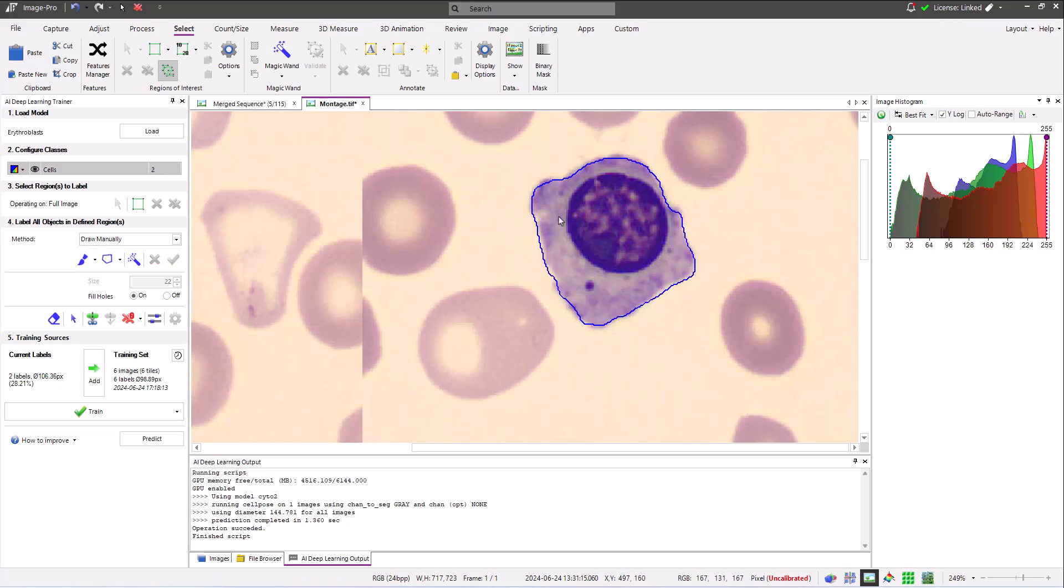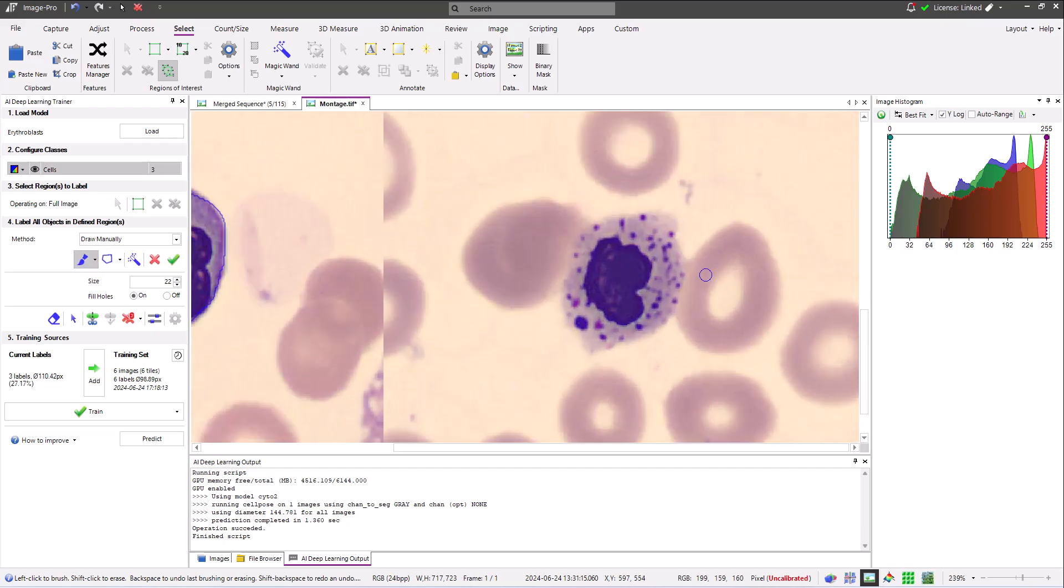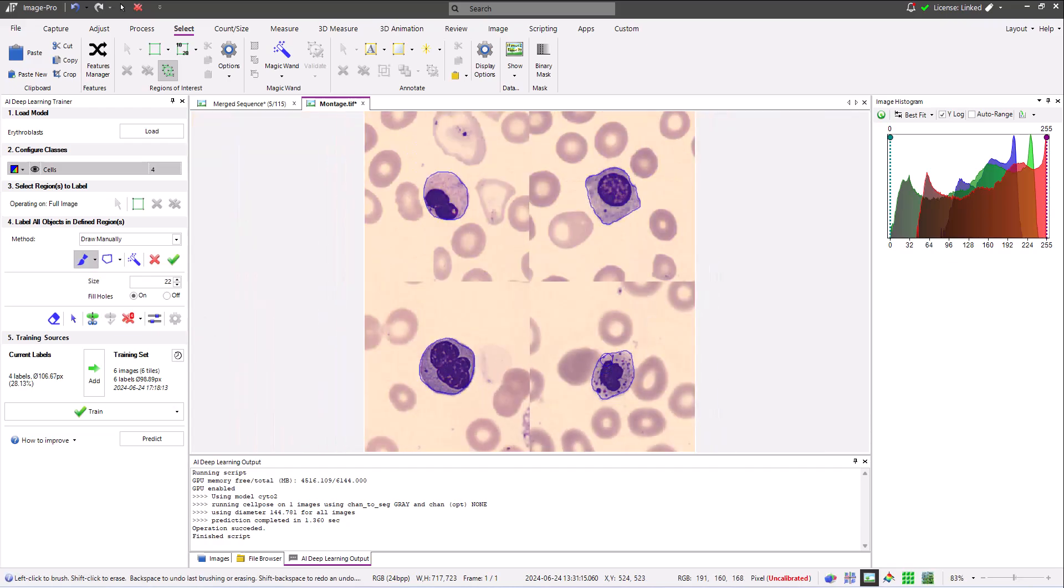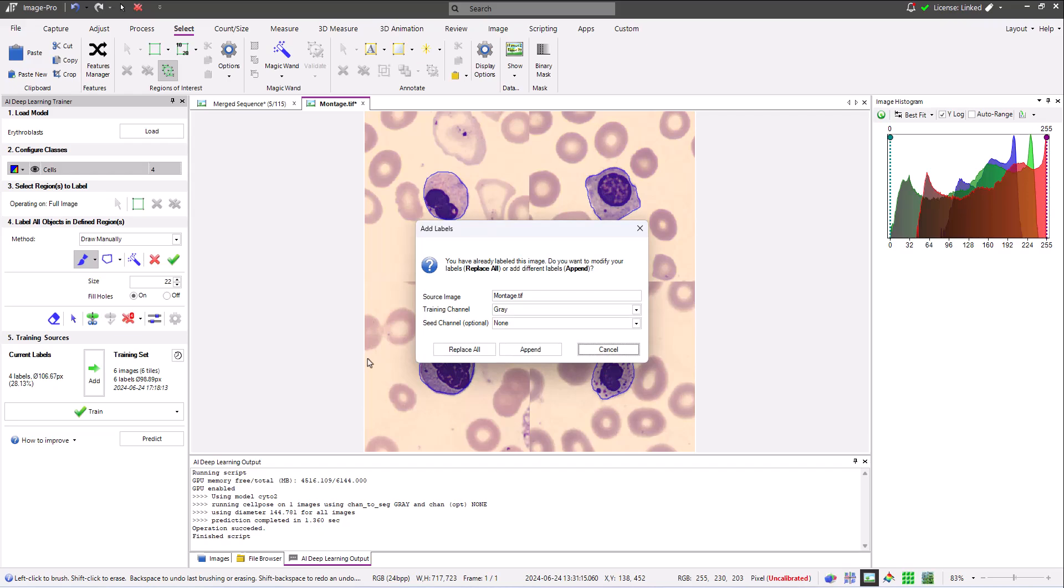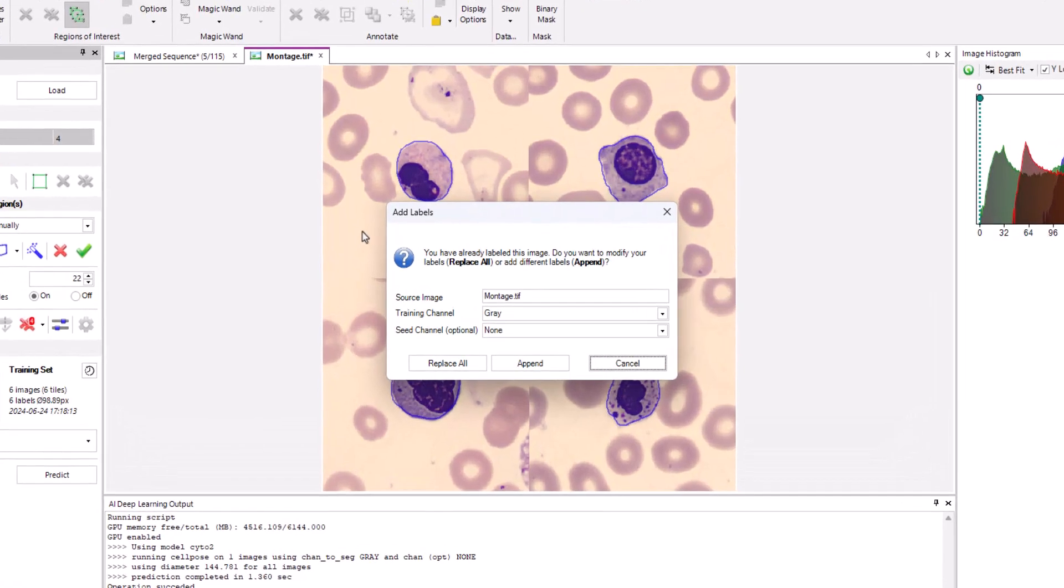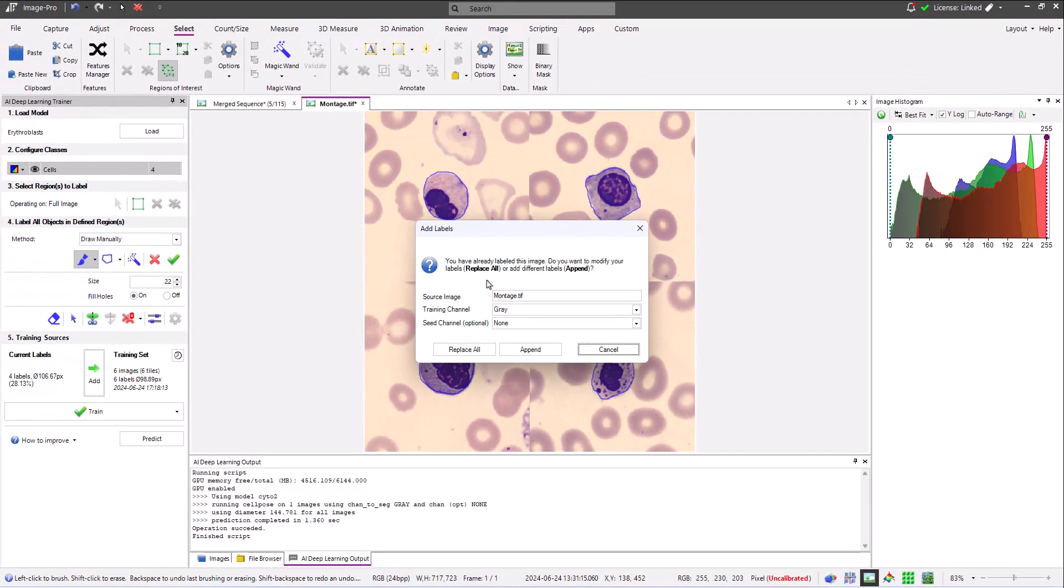Here, after removing the region of interest and labeling all the erythrocytes in my image, I'm clicking the Add button again. This time, because data from this image has already been added to the training set, I'm given the choice to either replace all of the training data with the current labels, or to append the current labels as additional data. The append option would be the correct choice if I added an additional region of interest that added different training labels. However, in this case, I'm selecting the Replace All option.